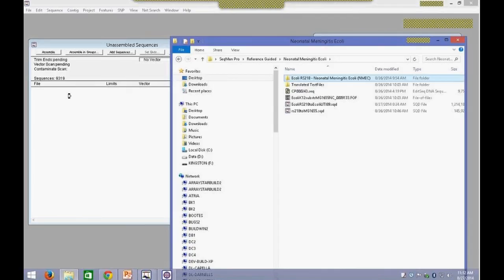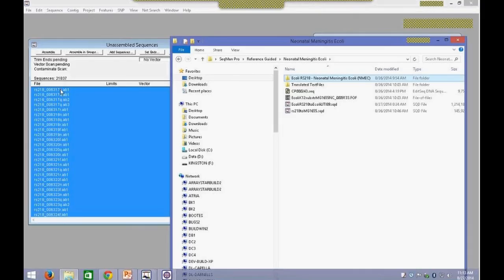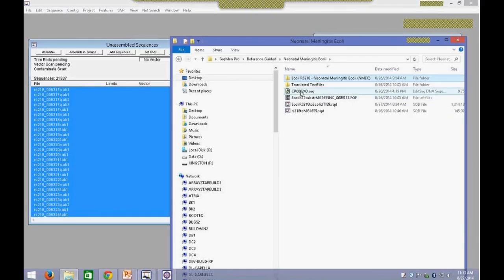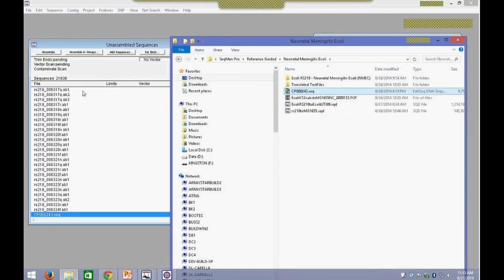As the data are being loaded, you can see the total counts of reference sequences being input into the software. A total of 21,837 reads — AB1 files. And then I also want to import my reference sequence. I can also drag and drop that sequence.